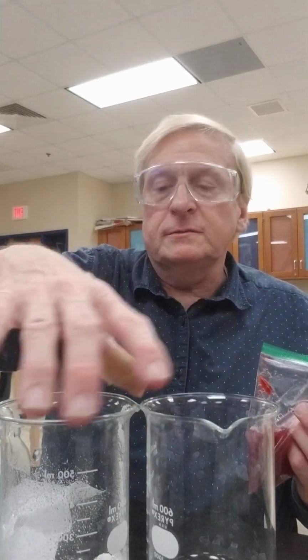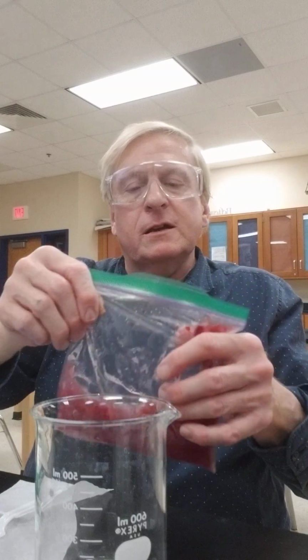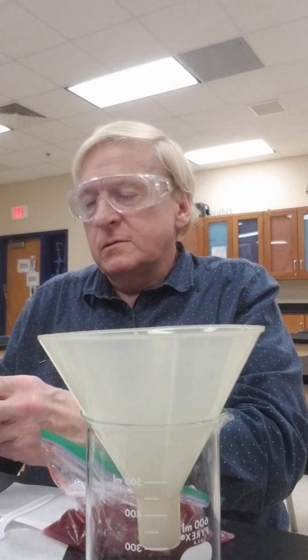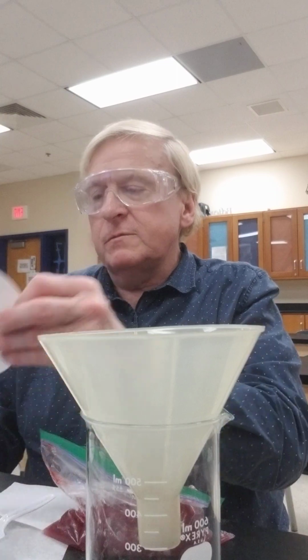Now you want to take a second beaker. Put the borax beaker over here out of the way. Take the second beaker. I'm going to use a funnel since I have it, and a scientific filter. I only need one of these. I don't need a bunch of them.